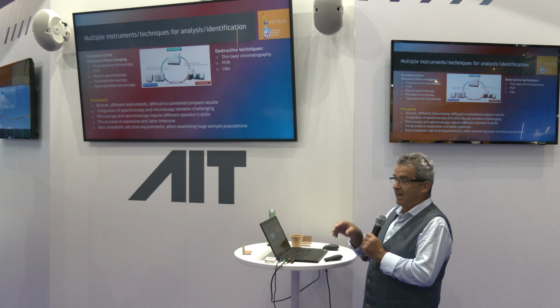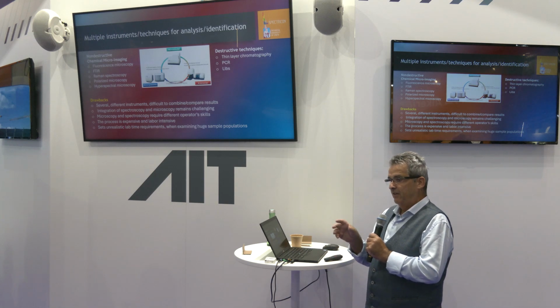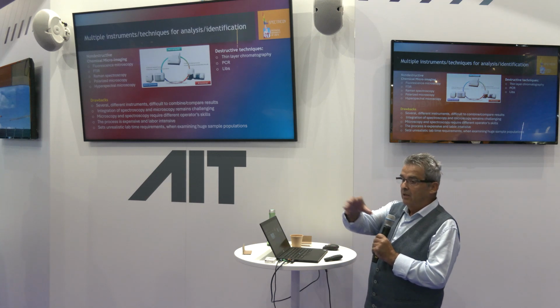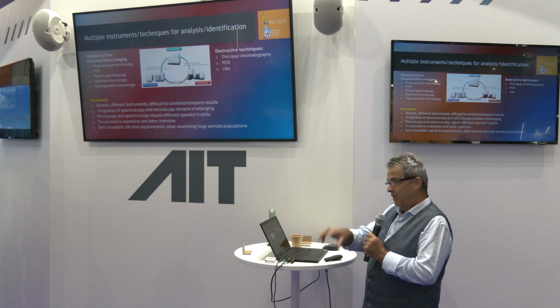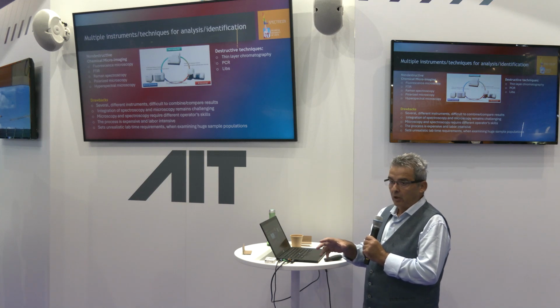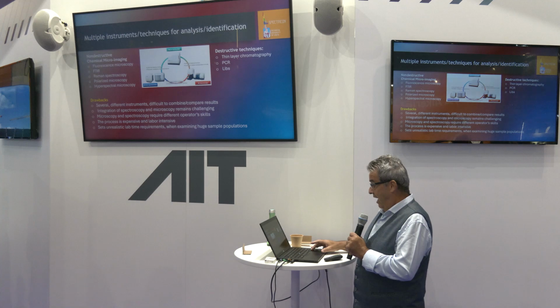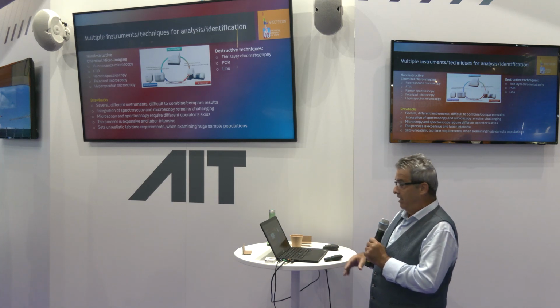the way it works today is they use several complementary techniques, including fluorescent microscopy, FTIR, Raman spectroscopy, polarized microscopy, and hyperspectral microscopy. So there are many different devices, different sensors, and there are several problems in comparing results from the different sensors, and it is a very time-consuming task to pass a sample through all this pipeline of microscopes and spectroscopic techniques. And that is the problem that we want to address with a multisensorial high-content screening microscope that we have developed.